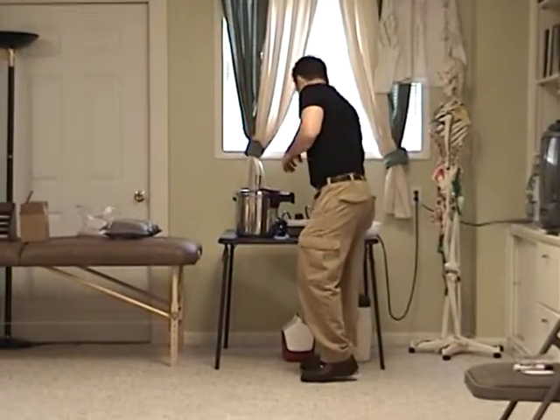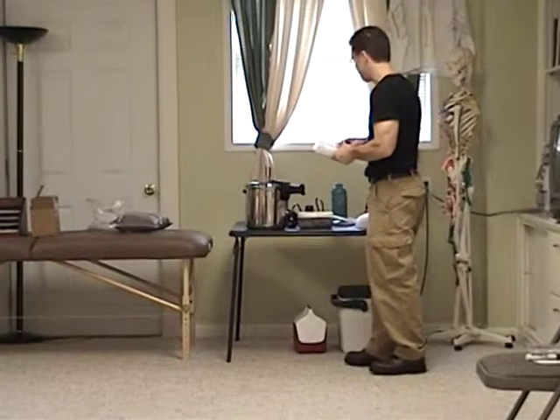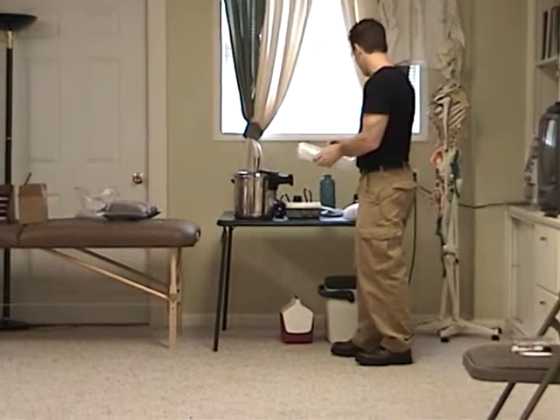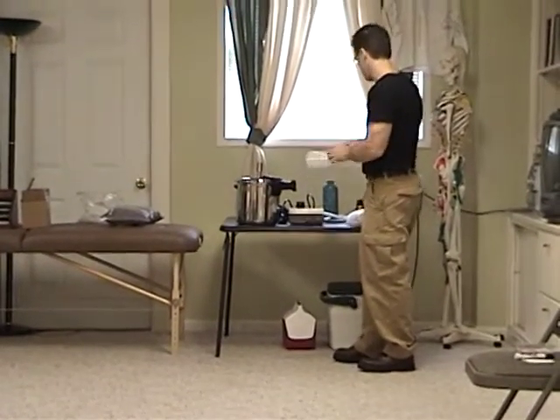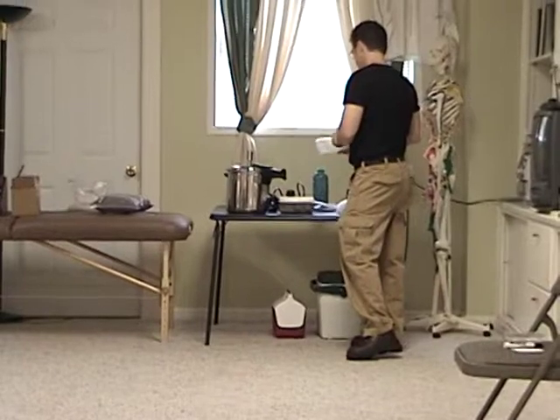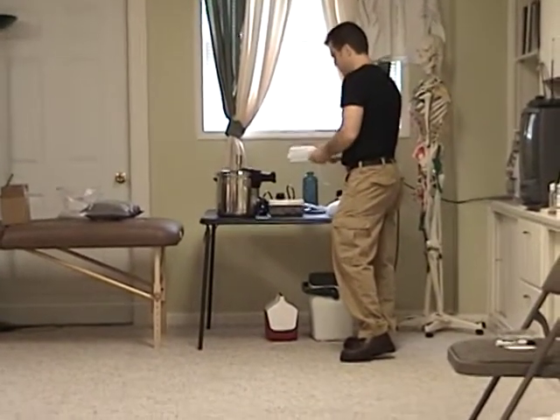This is the kettle portion of what has come to be known as the stove stove. This is a device that I invented about five or six years ago. I didn't really develop it to sell — I just developed it for my own research purposes.